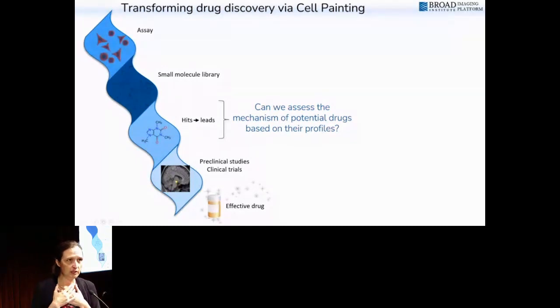The way we measure similarity with images is usually Pearson correlation, whereas my understanding is in CMAP, they pick something like, forgive me, I don't remember the details, but something like the top 10 and the bottom 10 genes that go up and down. So it's kind of limiting, making it a binary decision about a certain proportion of the genes. So we do that a bit differently as well.